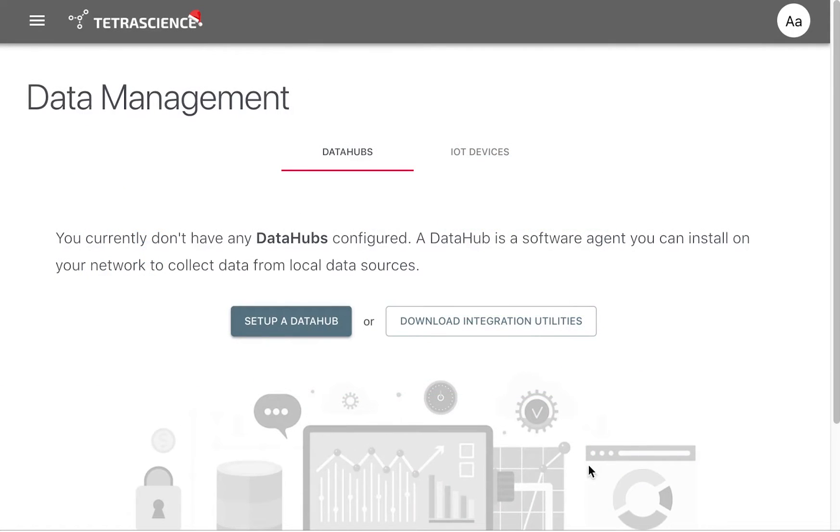Our first step is to set up our Empower agent. This is a Windows-based application installed side by side with an Empower client. The agent extracts injection data from the Empower toolkit, as well as additional data including methods and results.